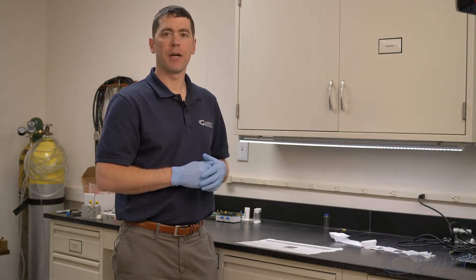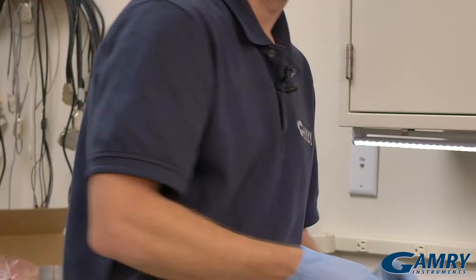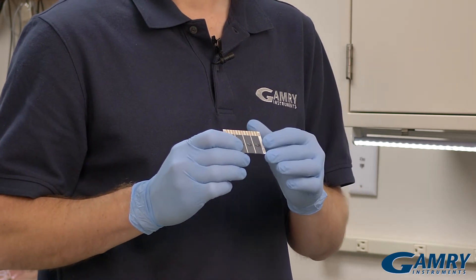Hi, I'm Chris Beasley with Gamry Instruments, and in this short video I'm going to show you how to break apart screen printed electrodes. Our screen printed electrodes come in groups of four and you have to snap them apart to use them individually.